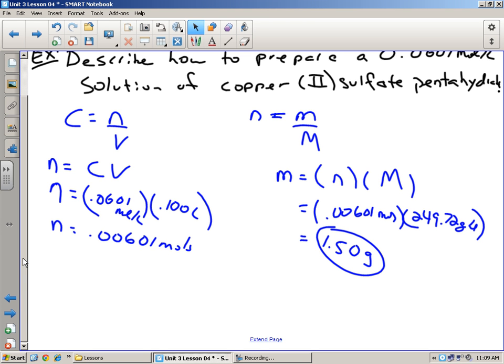So, you're going to do that once. Notice I still have stuff in here. Obviously, that's a problem. I don't want it in here. So you do it again. We're going to put some more water in here. Step 2, dissolve into a 100 milliliter volumetric flask. You can mix it up a little bit. Careful, don't spill any. And we're going to pour that into there. Oops, don't spill any.